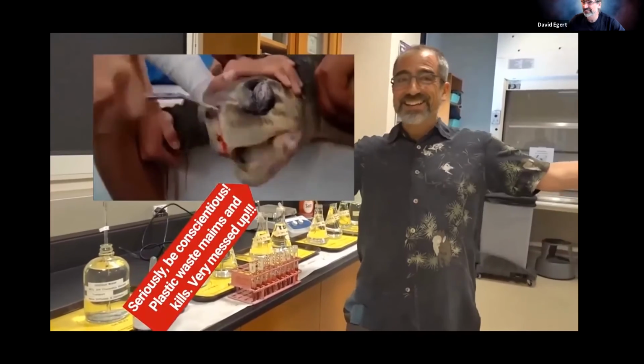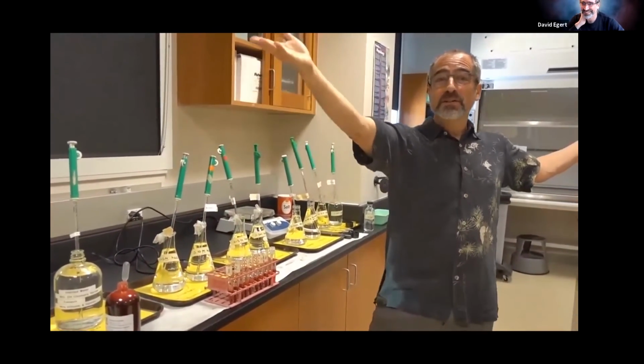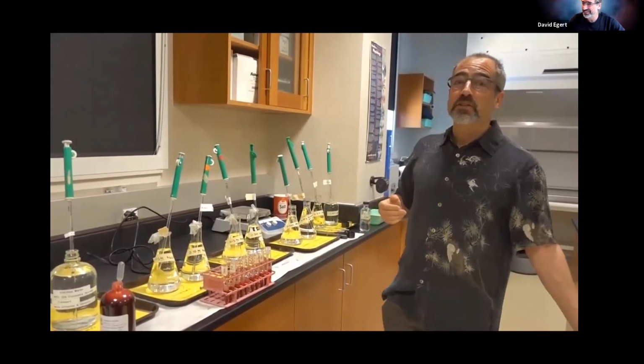All right, that is that. So next we will get a tour of the centrifuge.